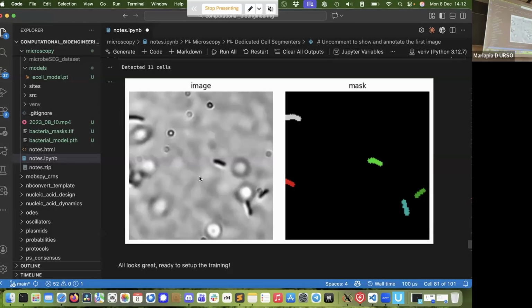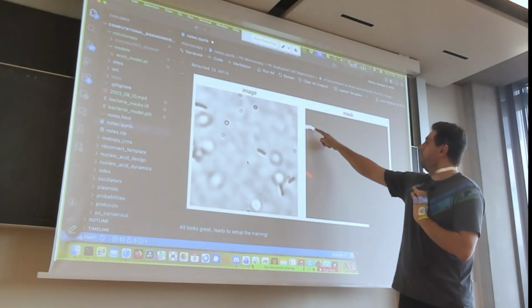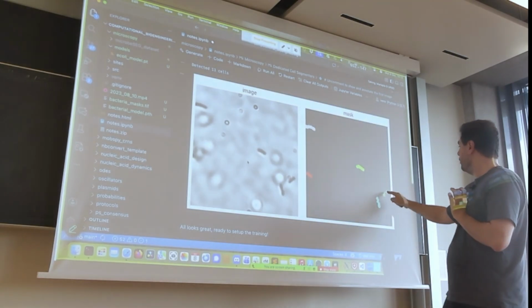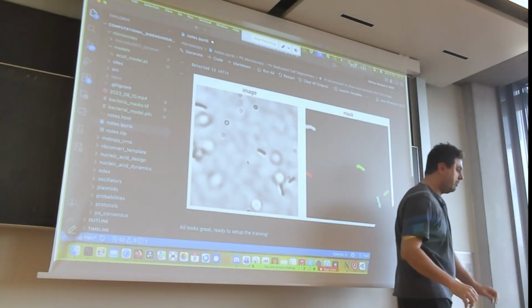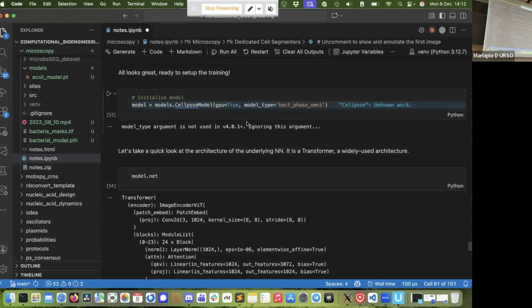And of course, this is now an instance segmentation. So this is really a different label than this. Background is label 0. Let's say label 1, 2, 3, 4, 5. Right? And now we have this. We are ready to learn.